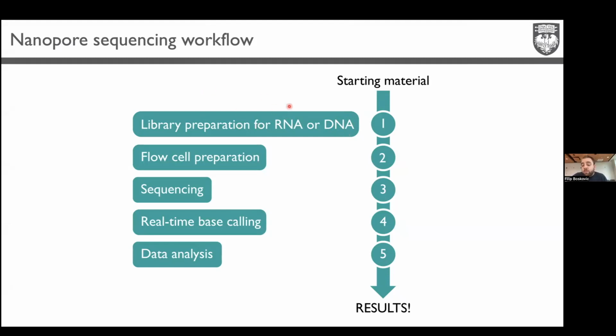So once you prepare your molecule, that usually takes, for RNA at least, relatively little time. It's like a 2-hour protocol with all the enzymatic reactions, adding adapters, of course, for sequencing. That's a sequence that you need to ligate. And usually it's all provided in the kit, except for some external enzymes that you should pre-order. And it's also written in the kit what you would need.